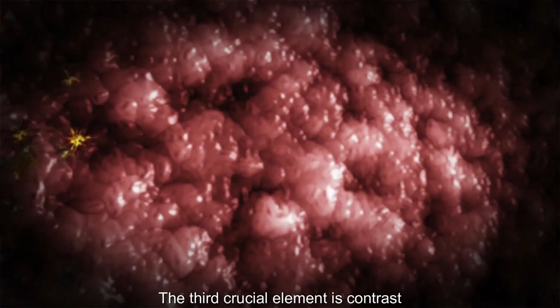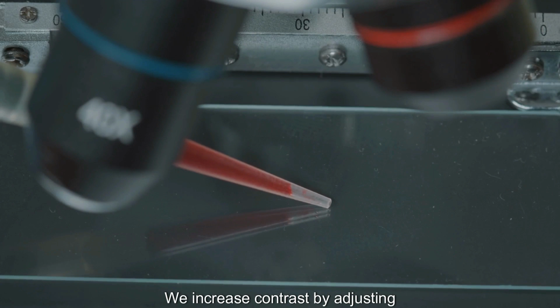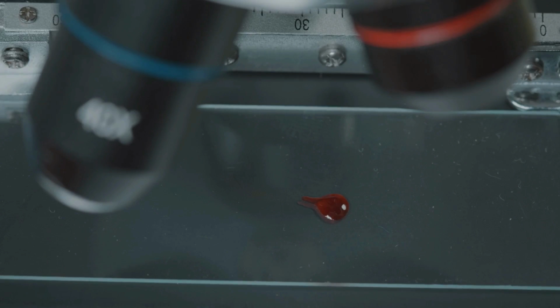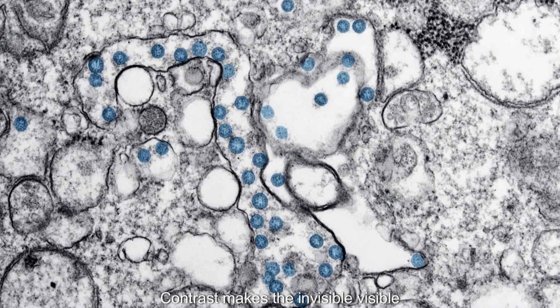The third crucial element is contrast. Many cells are almost completely transparent, like ghosts in water. We increase contrast by adjusting light on the microscope or by using special stains. Stains are dyes that color parts of the cell so they stand out. Contrast makes the invisible visible.